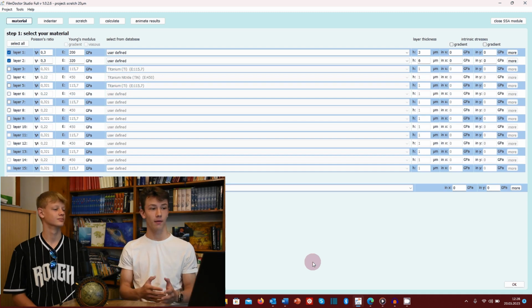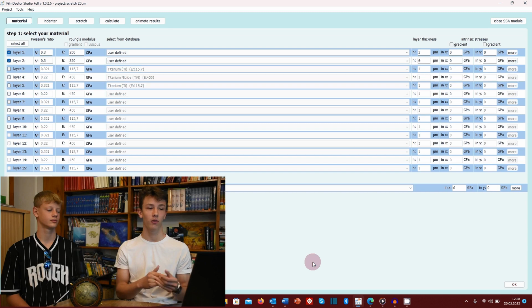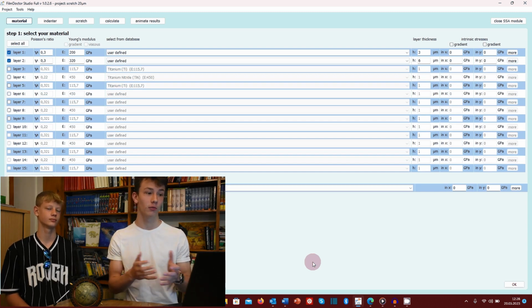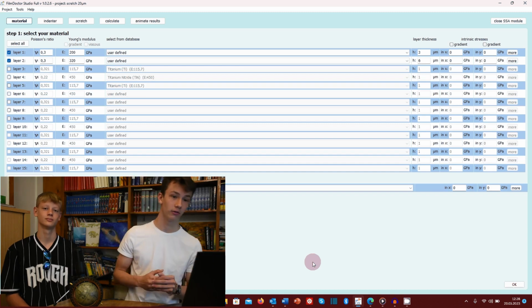Alright, now we are back, and I've already prepared everything, so it's already calculated. This is just one example. Of course, the measurement data has nothing to do with anything we had in the first video. This is just one example to show you what you have to watch out for and what kind of results you're going to get. If you want to know more about how the SSA module works in the FilmDoctor, you can simply look at my other videos.